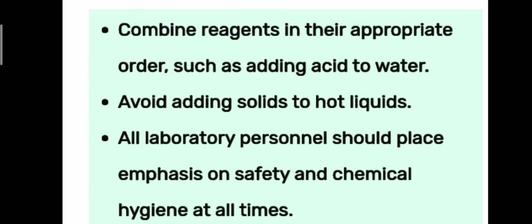Combine reagents in their appropriate order, such as adding acid to water. Avoid adding solids to hot liquids. All laboratory personnel should place emphasis on safety and chemical hygiene at all times.